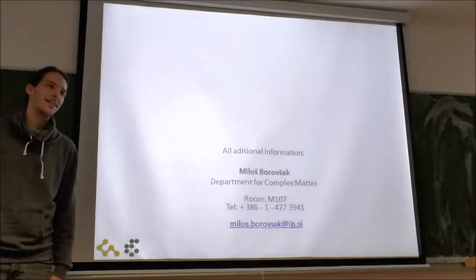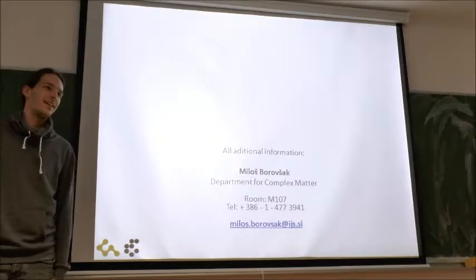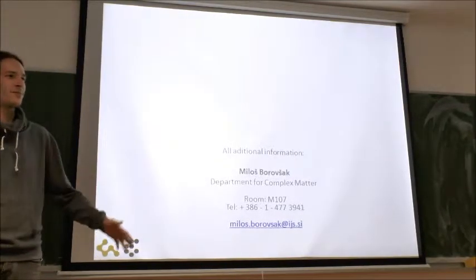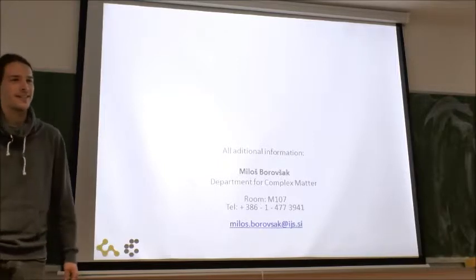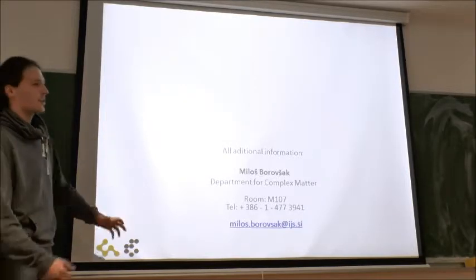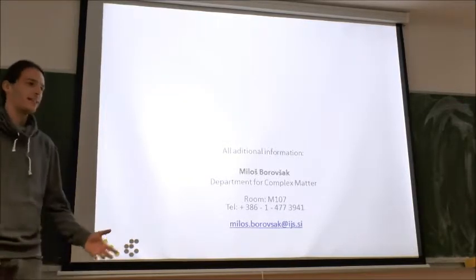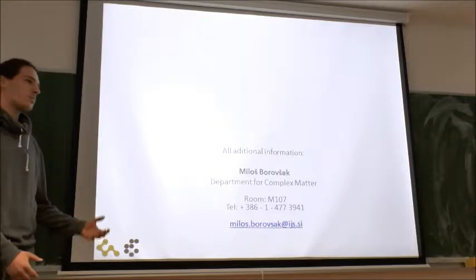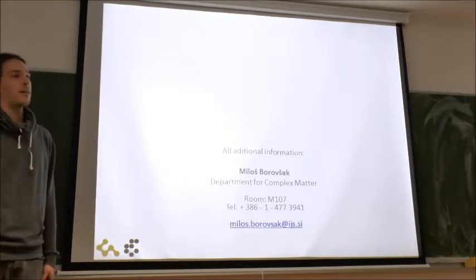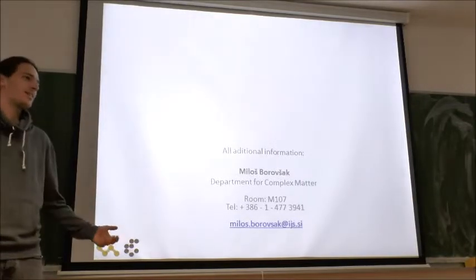Somebody else? What was the price of this machine? It was something around 600,000 euros. Yes, 600. Well, we actually have one additional AFM that is in vacuum, but we cannot use it in combination with the Raman. So actually there are three systems there.